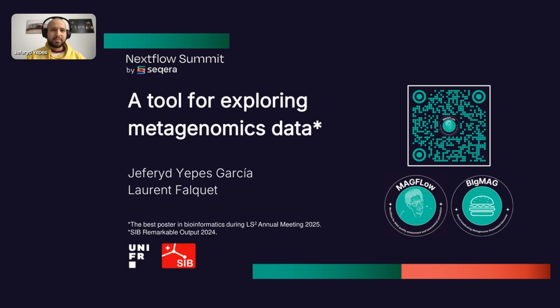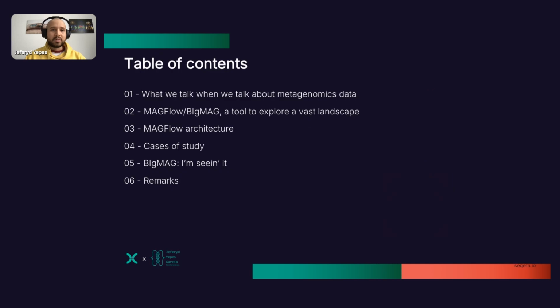So let's get started with the content of the presentation. First, I will give a bit of context and what we need to know and where this tool will be useful for you. Now, we'll talk about the landscape, how this tool is framed within a specific landscape. Then I'll show you a bit of the pipeline architecture. Then we'll have a few case studies, and then we'll see the application in action. And finally, of course, we will have some remarks.